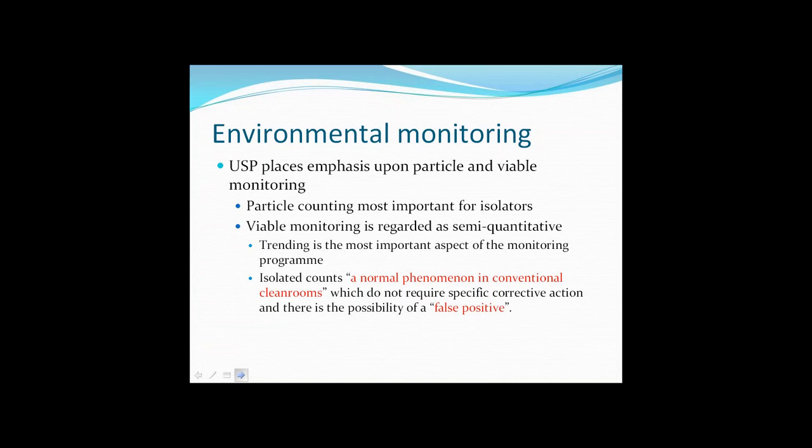And in the context of this, the chapter reiterates that isolated counts will occur with aseptic filling, and aseptic filling is not sterile filling. And these isolated counts, it does use the term false positives, by which it means counts largely arising from personnel intervention.